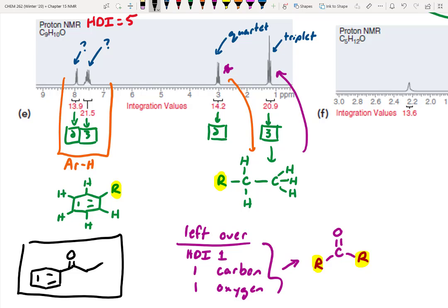How do we know about the carbon oxygen double bond being immediately linked to the ring? That's a good question. So we know that these two pieces right here and here can't be linked. Why? Well, we wouldn't have any place to put our CO double bond, right? So the only logical place where it could go is in between those two pieces. Otherwise, we wouldn't have any attachment points to link our remaining atoms onto.